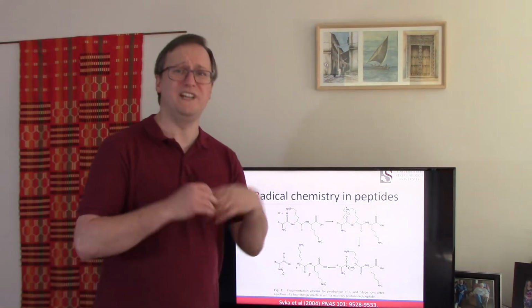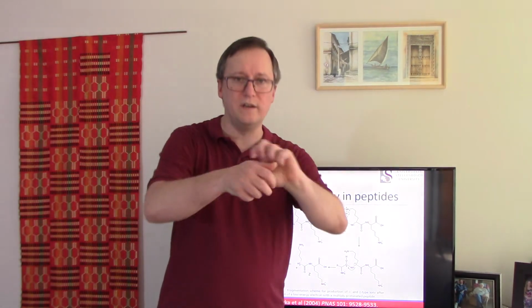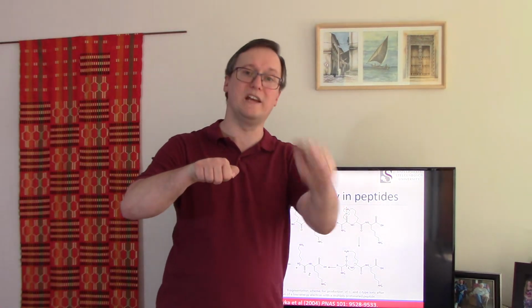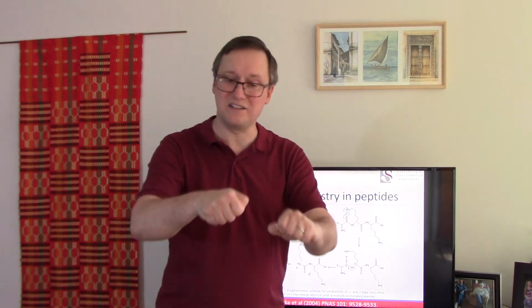So this is a relatively gentle process. It doesn't require multiple collisions. It requires one chemical reaction between a singly negatively charged carrier and our multiply charged positive protein ion. So we drop one charge, create a radical, and now the protein has split. So its charge, which just dropped by one, is now divided between the two ions that depart.